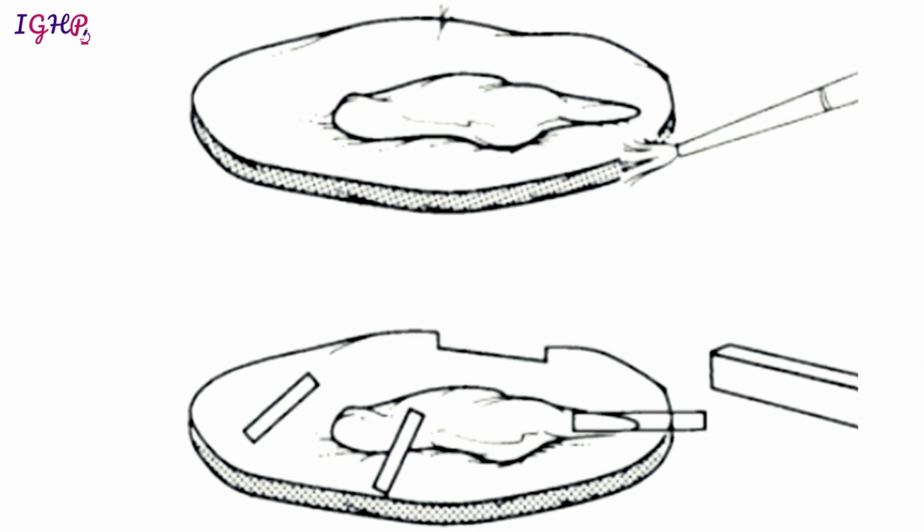Normally, if the lesion is in the center, you should cut it on the surface where the exposure of the surface will be maximum. But if your lesion is near to one margin, like here the lesion is near to one resected margin and near to one lateral margin, in those cases I would like to cut it in a transverse section, so that I can take sections of the lesion with the closest resected margin, and then I can also prove the distance of the lesion from the closest resected margin.